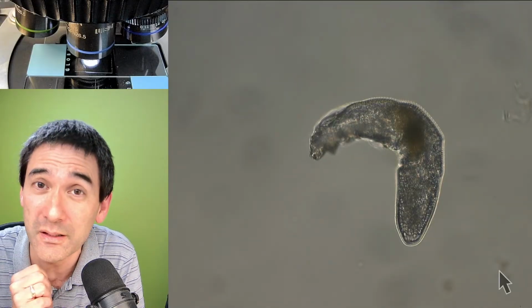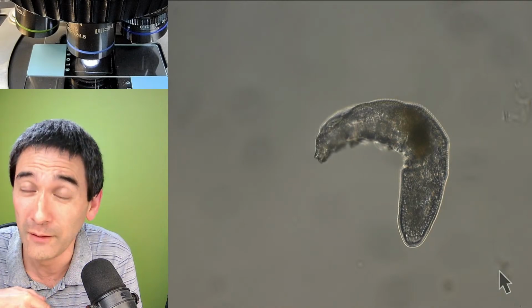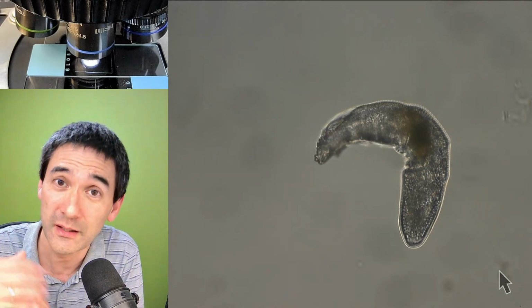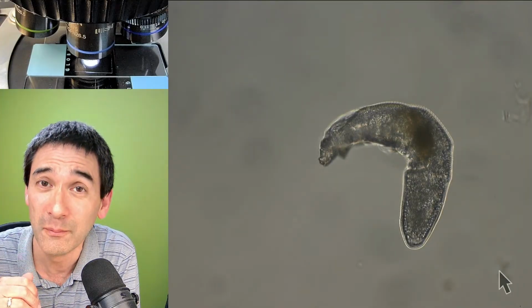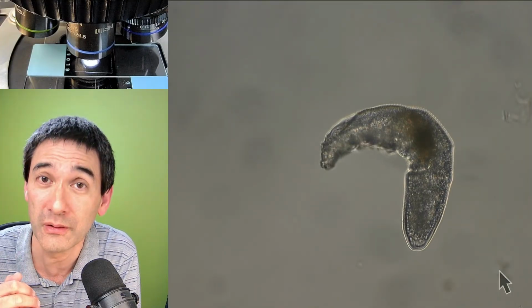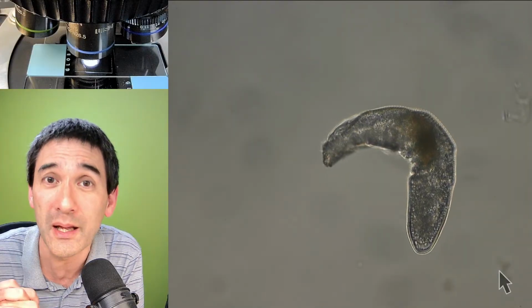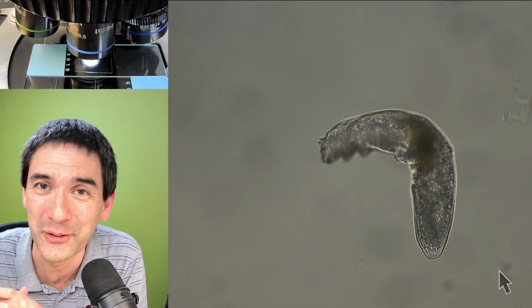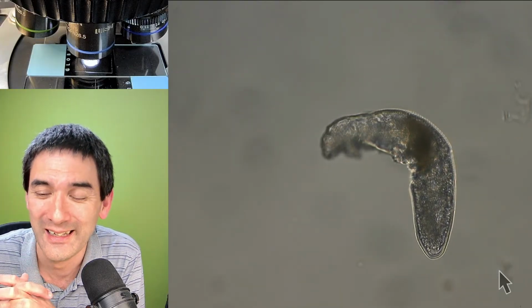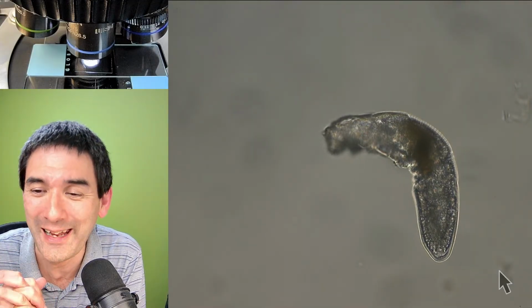Apparently, there are millions of them growing inside the mattress and the pillow, feeding on skin that we're always shedding. Some people are allergic to the excrements of these dust mites, but my collection technique today was not able to find any. But what I'm going to do now is call it a day.